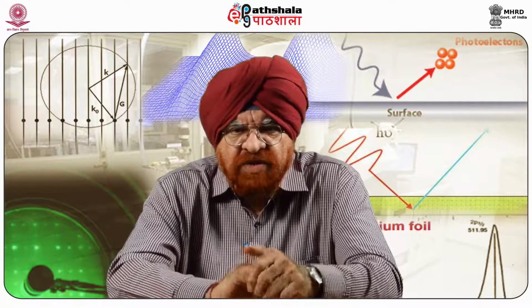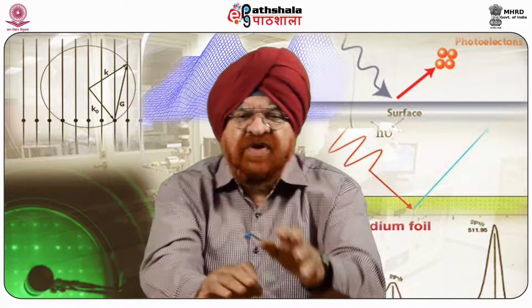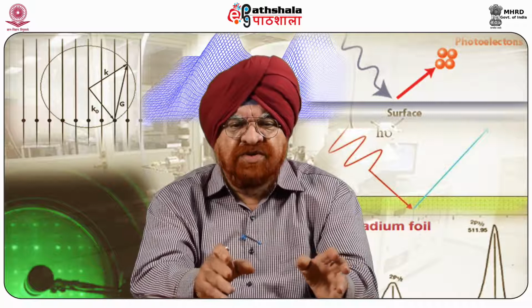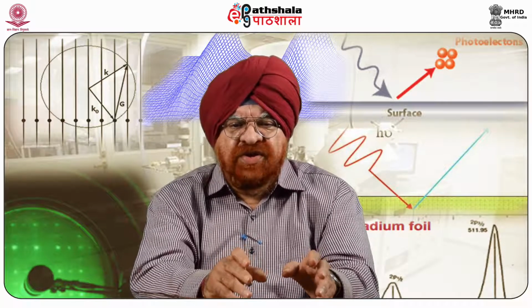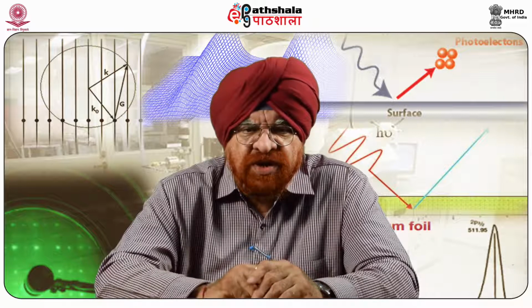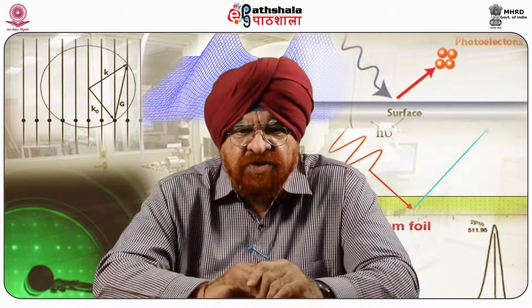The AFM can examine rough surfaces since its vertical range is more than 5 microns. Analytical reports of AFM results include three-dimensional images and quantitative data analysis, such as feature sizes, surface roughness, and area and cross-section plots, and can be interpreted in the context of your problems.